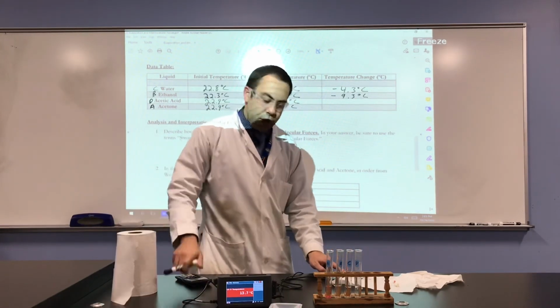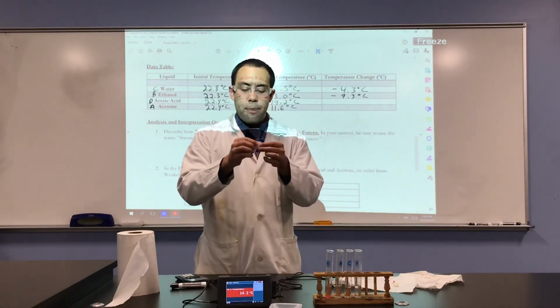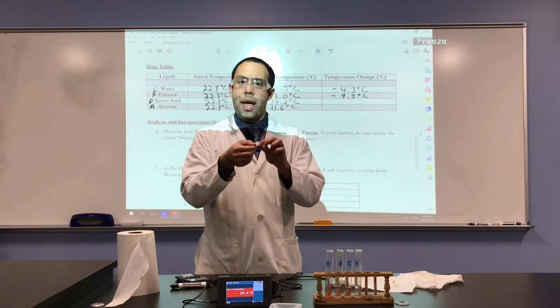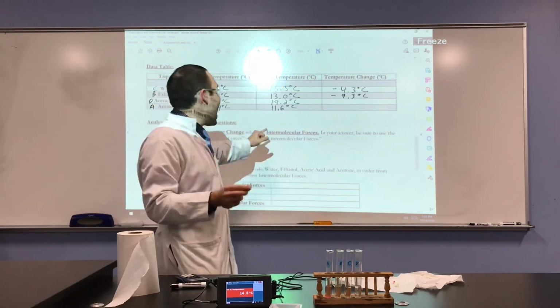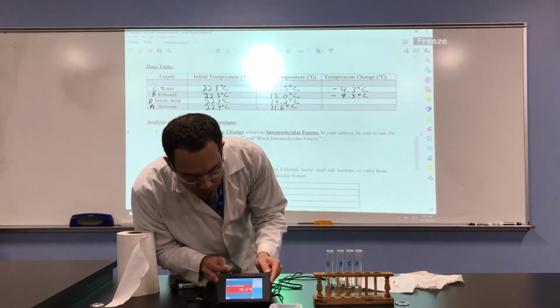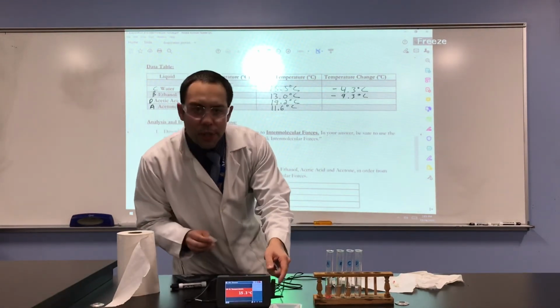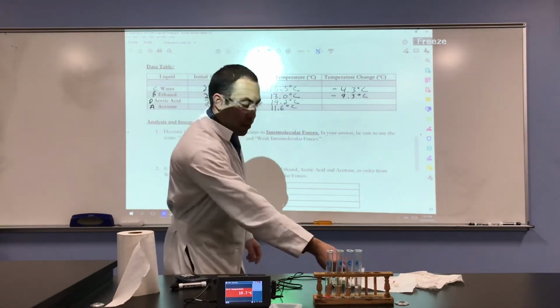And let's take a look at the filter paper. The filter paper is completely dry. All of the acetone evaporated, and that's why the temperature is starting to climb. So now there's no filter paper on the probe, and we're at 15.2, and it's going to climb back up to room temperature. So we can put that aside.